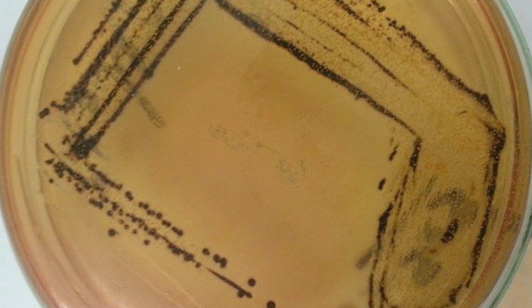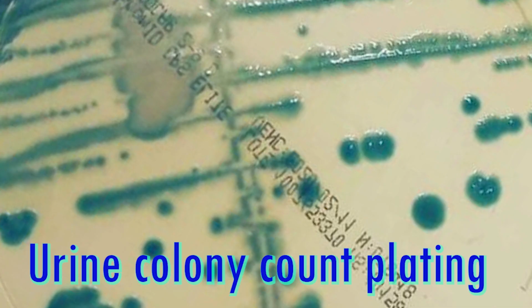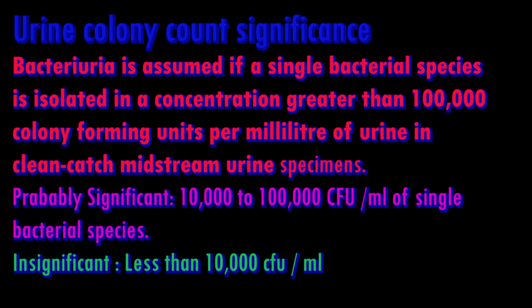Tissue. Sample may need to be homogenized. Gram stain, blood agar, chocolate agar, MacConkey agar, anaerobic media, thioglycolate media if indicated. Urine sample, clean, voided, midstream urine, gram stain, blood agar, MacConkey agar, or CLED agar may be used. Plates for urine colony count should be done.